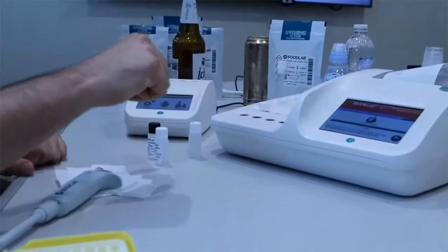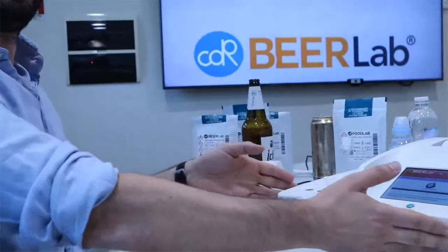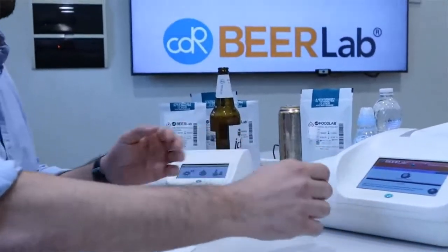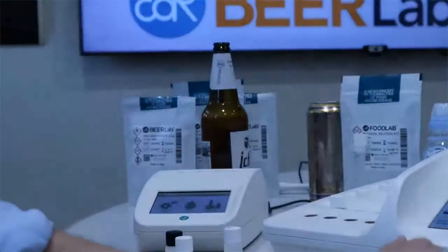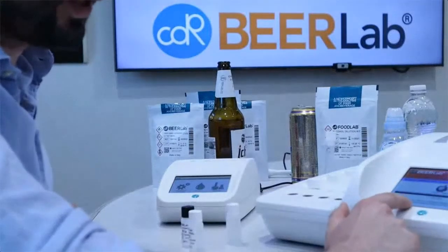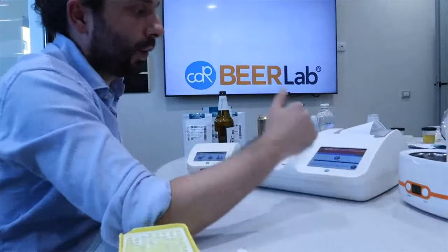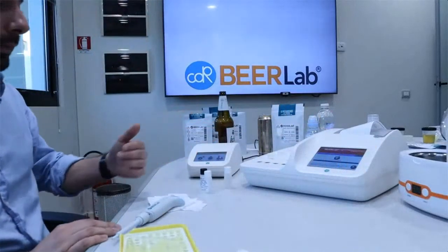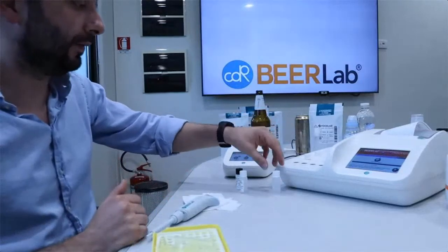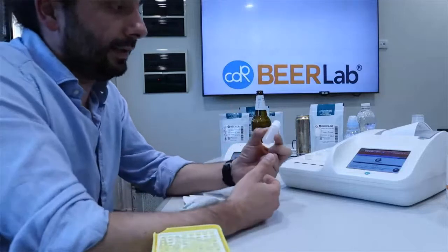On the screen you have the method, so you can read the method on the screen. It is written: add 100 microliters of R1A, and after you have to add 100 microliters of diluted sample. Here we have already prepared the dilution to save time.